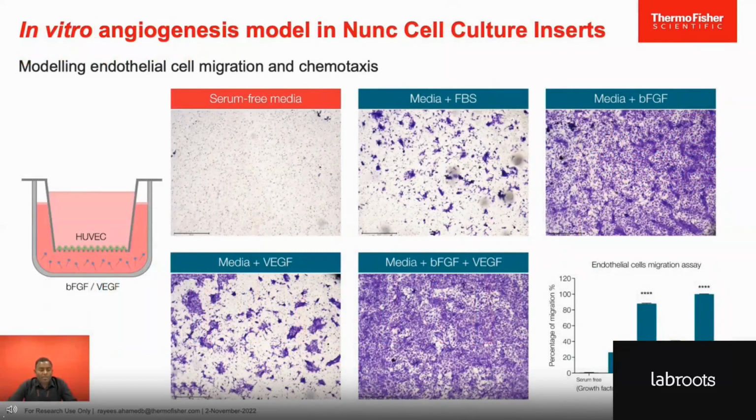Okay, so the next important application we have demonstrated with cell culture inserts is modeling the endothelial cell migration and in vitro tumor-induced angiogenesis.